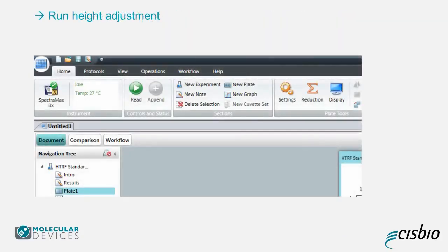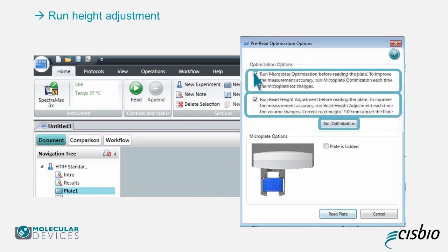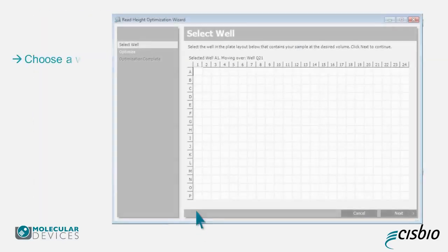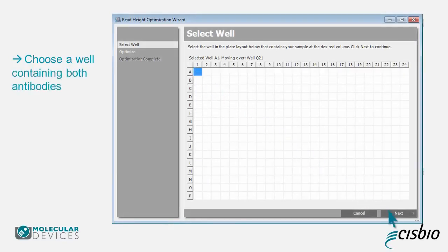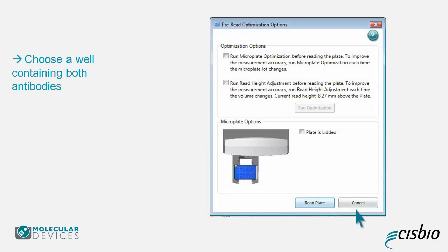Left-click the Read button at the top of the main screen window, and the instrument will open the Pre-Read Optimization Options window. Choose to optimize the read height and click on Run Optimization. You can also choose to run the microplate optimization, which can improve your sensitivity. Choose a well containing both antibodies and click on Next. After the optimization is completed, save the results, then click on Read Plate.